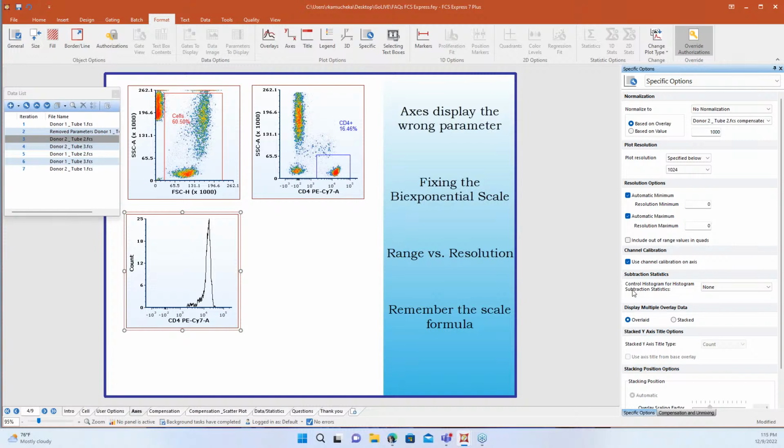Yeah, that is so true about that stretching. I have seen that before. Yep, now it gets real fuzzy too. So not only does it look stretched, but they don't look as crisp anymore, and that's just because you're trying to pull that data across a range that's really not appropriate for the data. Whereas that minimum maximum will move it up and down if you are too far squashed on one side or the other. Yeah, that's a great point.